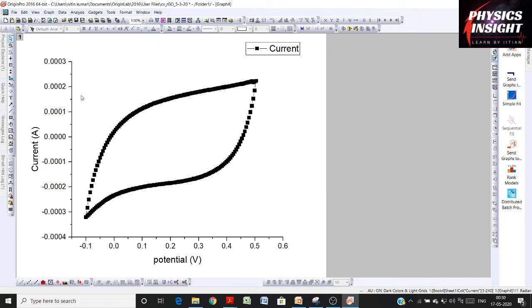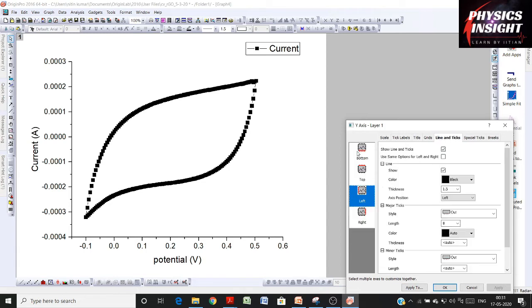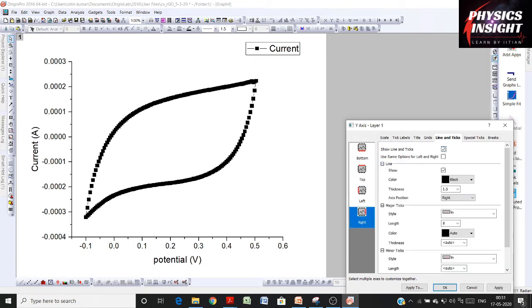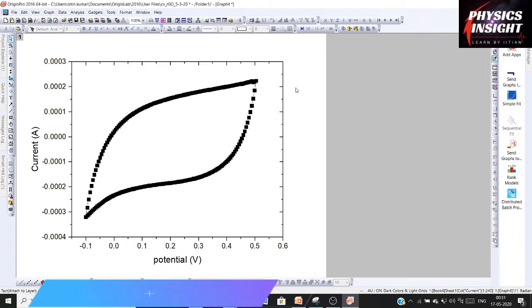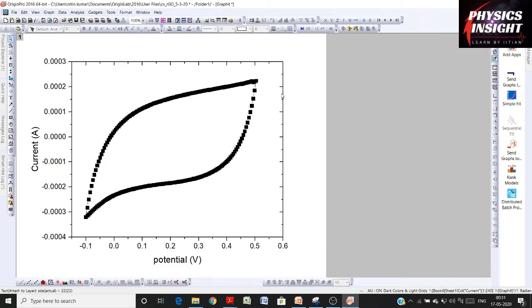Just doing some modifications to make it look better. This data is for a scan rate value equal to 1 millivolt per second.